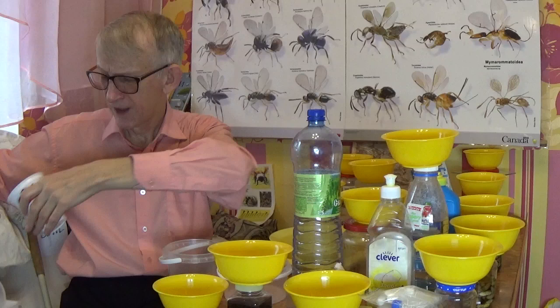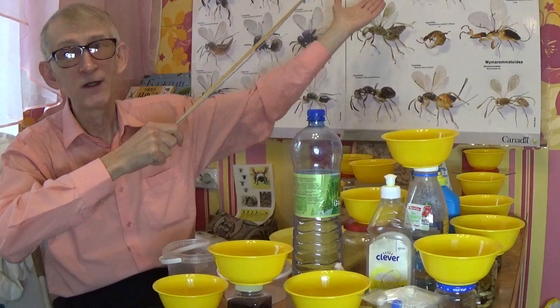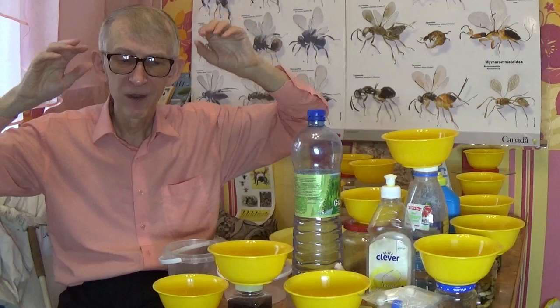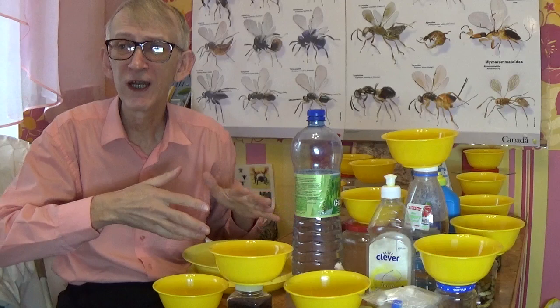These tiny parasitic Hymenoptera are very small and fly around like plankton, like small fish in water. You cannot even see them, but when they fall inside the trap you can recognize them, because these traps can be filled with a huge number of insects.